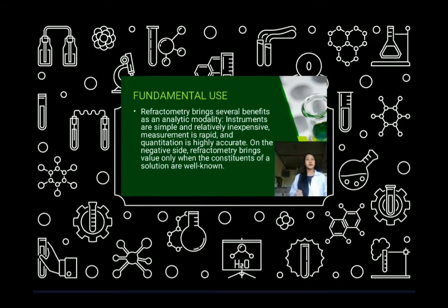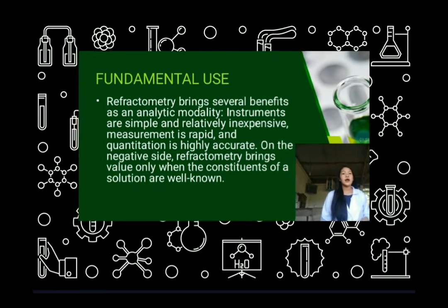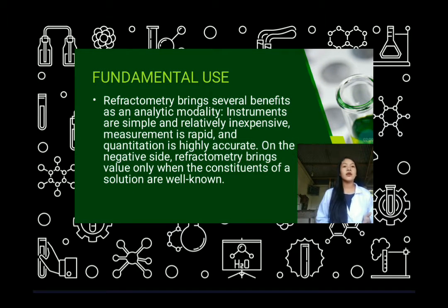So, the fundamental use of refractometry brings several benefits. As an analytical modality, the instruments are simple and relatively inexpensive. Measurement is rapid, and quantitation is highly accurate. On the negative side, refractometry brings value only when the constituents of a solution are known.